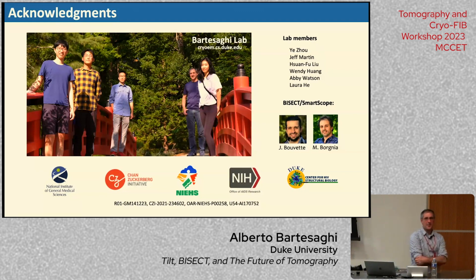Hi, this is Mahfouz Rahman from Thermo Fisher Scientific. I have a question about single particle cryo-EM, where, as you mentioned, apoferritin has become a standard to start with. For tomography, is there anything that everybody could reproduce and use as a benchmark?